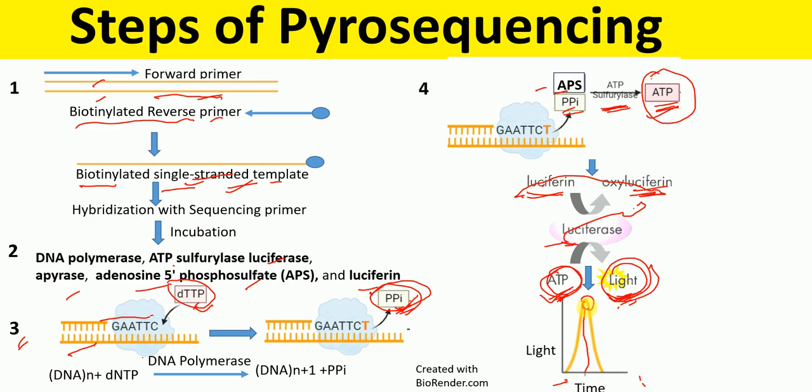The height of the peak is proportional to the number of nucleotides added. And in the next step, what happens?